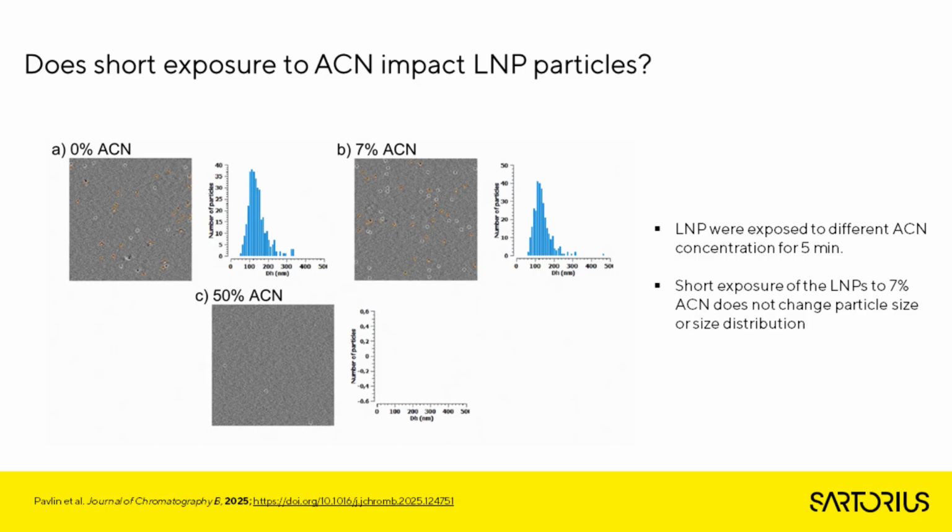Another thing we were interested in is how acetonitrile influences the LNP size. So we exposed the LNP sample to different concentrations of acetonitrile.